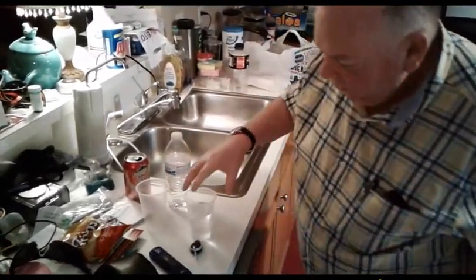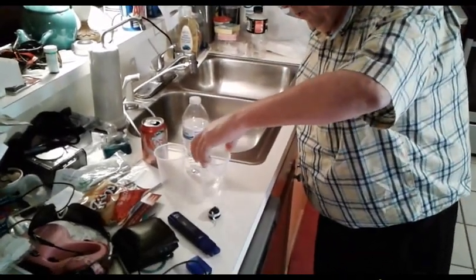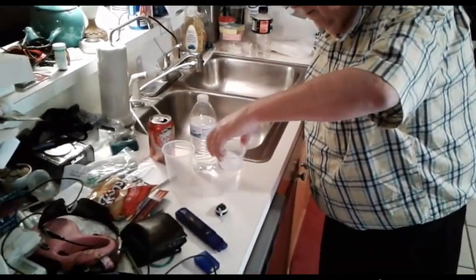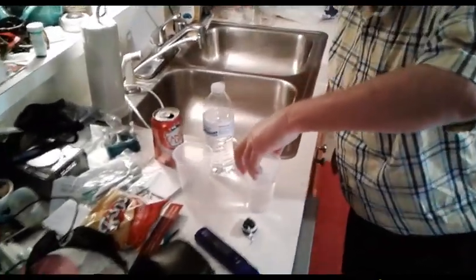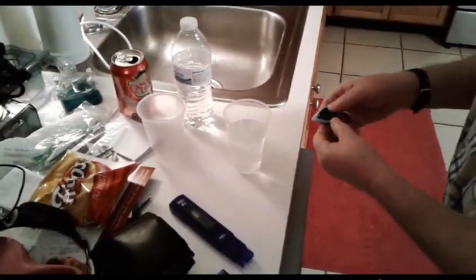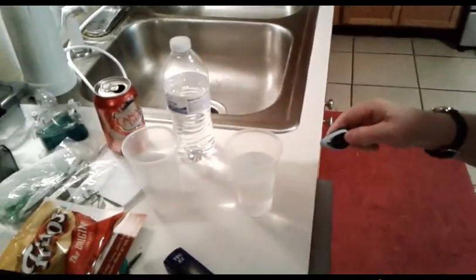What we do is we swirl this around for five seconds — one, two, three, four, five. And then I'm going to push the button and measure right above the water line. Ready?